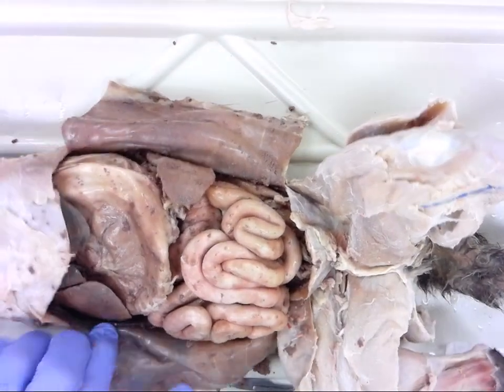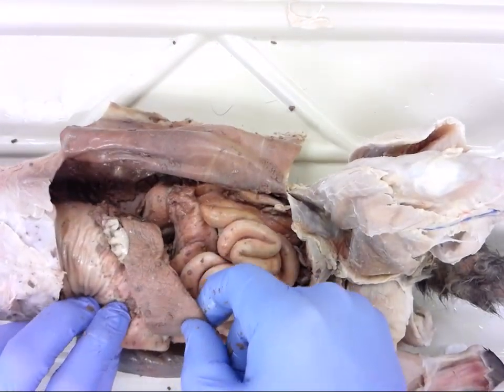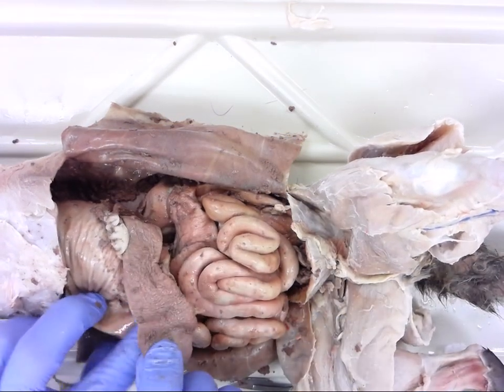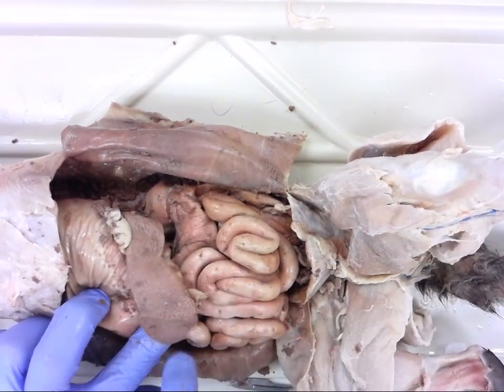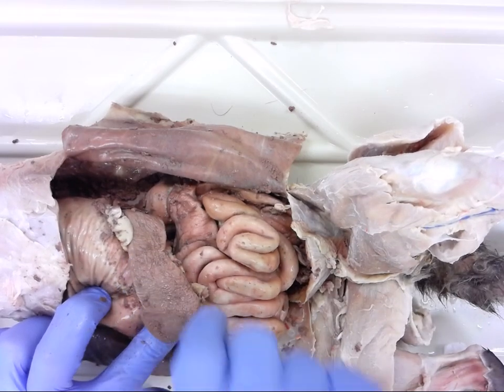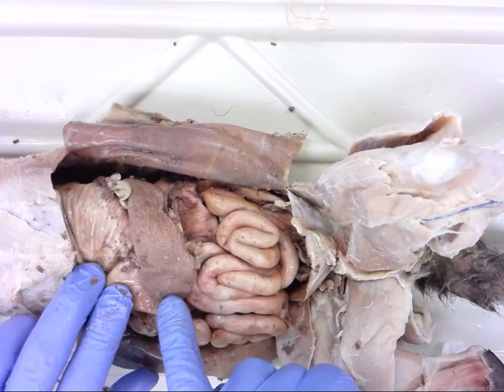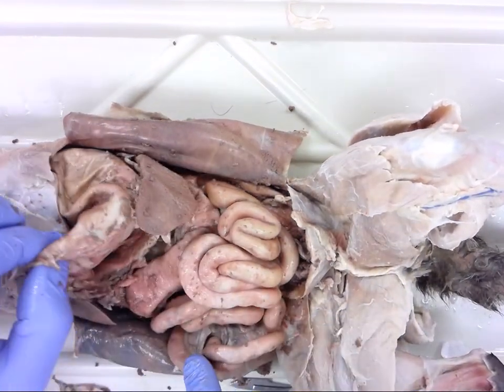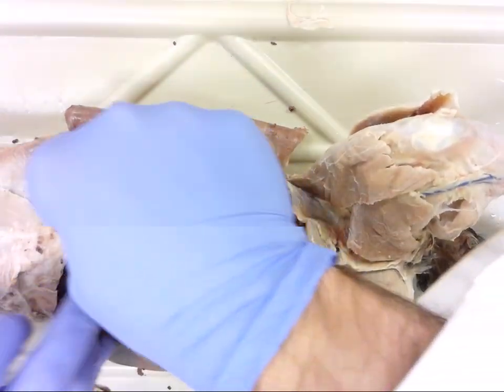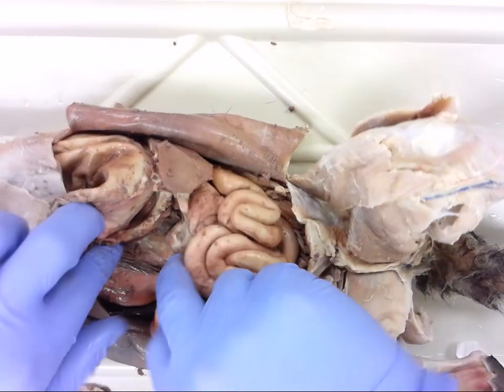All right. Off to the side, this sits right along the side of the stomach. It kind of looks like a tongue. This one is sort of brownish in color. Sometimes they're a little more reddish or purplish. So the spleen runs along the side of the stomach, fairly easily identified. Then, let's see if I can find it in here. Running along the small intestine, yes.